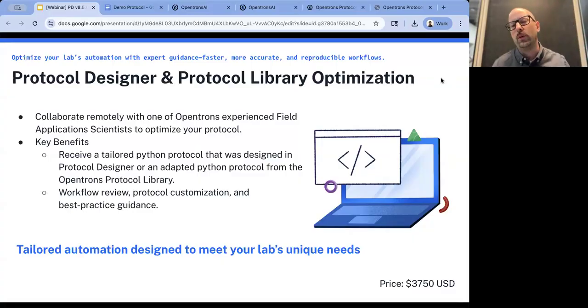If you download Protocol Designer and then turn off your internet, it will still work. It's got everything it needs. So there's ways to run Protocol Designer offline. We have customers in a similar boat. Sabine, I would maybe reach out to support and we can get you some help there.